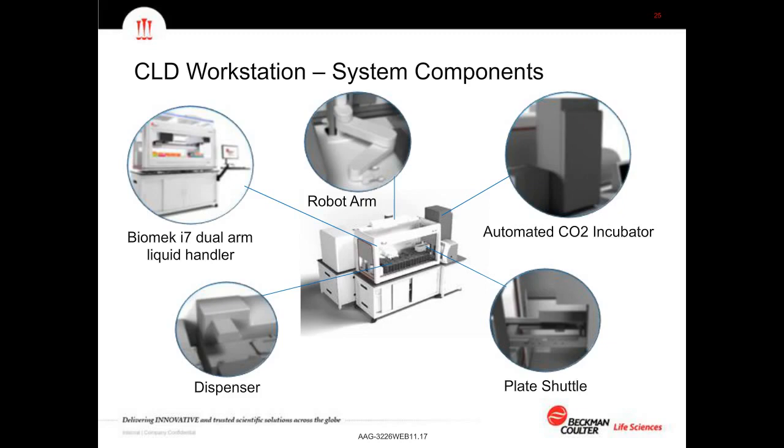And then we also have a dispensing device integrated on deck, which on this system actually serves two functions. It both seeds cells into 384-well plates at the beginning of the process, and it delivers media to those plates as we move on into 96-well plates also.